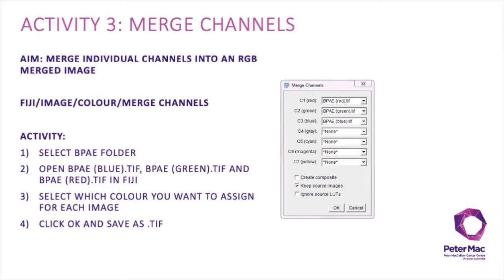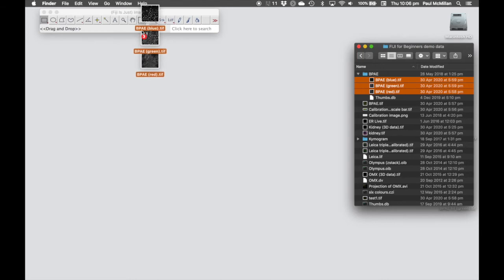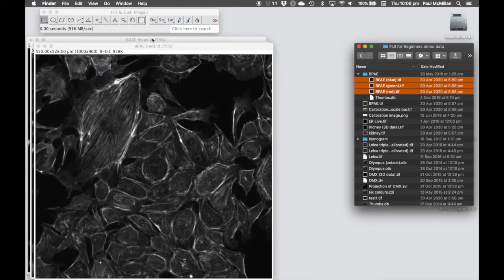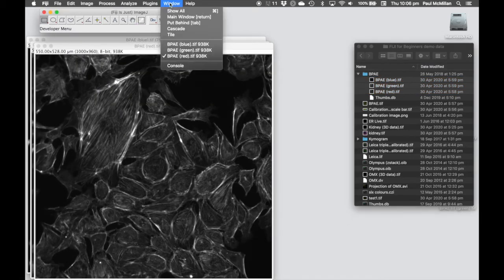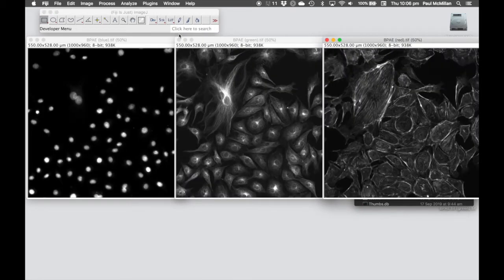Activity 3 is merging channels. In this case we're going to take individual channels and merge them into an RGB image. We're going to open up the BPAe folder and highlight all three BPAe blue, green and TIFF images to use in this activity. We can drag and drop these all at the same time. Since they're sitting on top of each other, let's go to Window Tile, just to make that a bit easier for us to visualize.